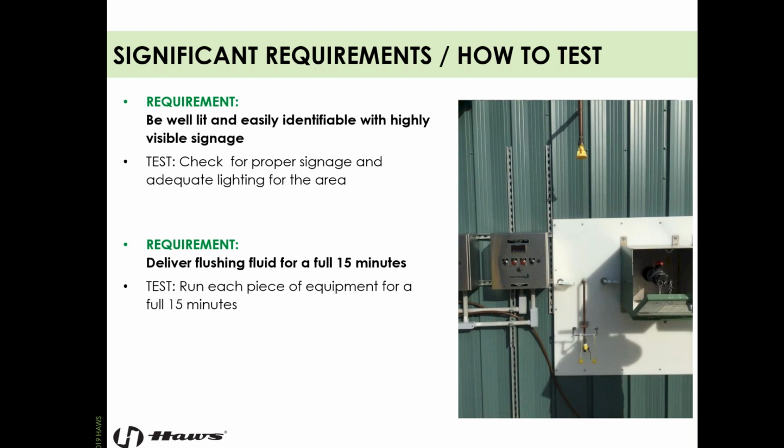Okay, now it has to deliver flushing fluid for a full 15 minutes. That's where that 15-minute test comes in. Again, maybe test the capabilities of a loop of water connected to several devices to supply 15 minutes, or just activate the equipment for 15 minutes. If it's outdoors or there's a drain nearby, it's a lot easier. Otherwise, you're going to need a way to capture the water and move it.